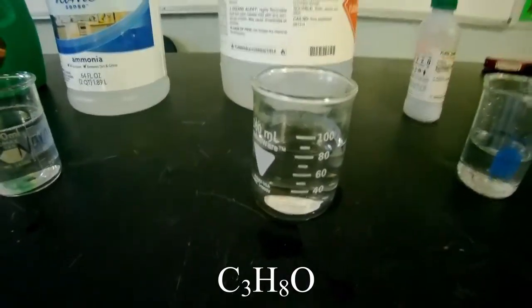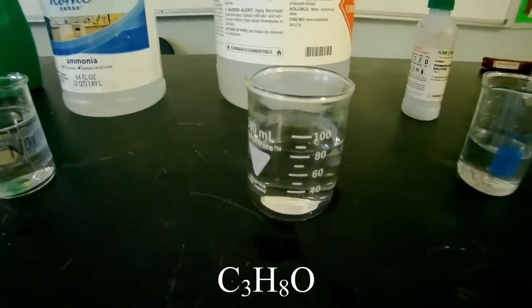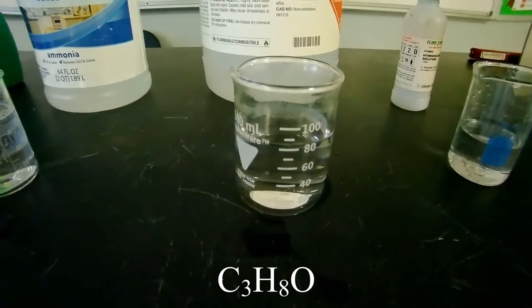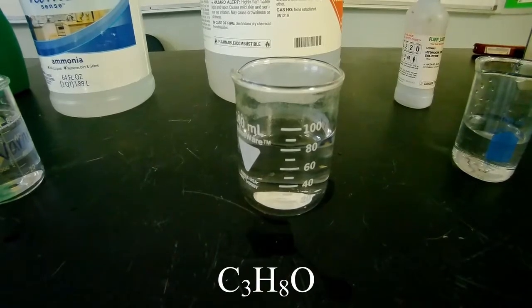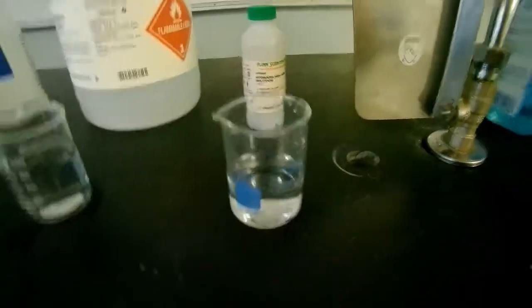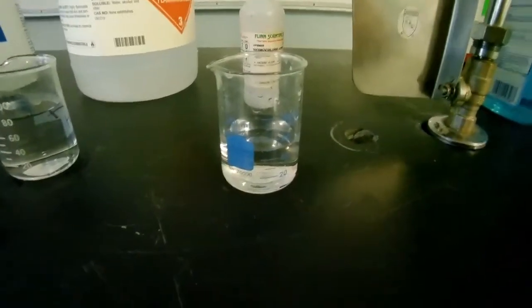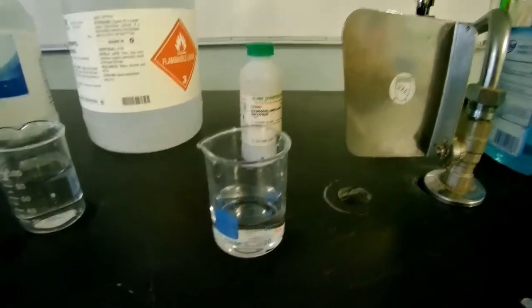So it's got some carbon in it, some hydrogen in it, and some oxygen in it. So what do we think? Let's go ahead and describe it and make a prediction. Acid or a base?